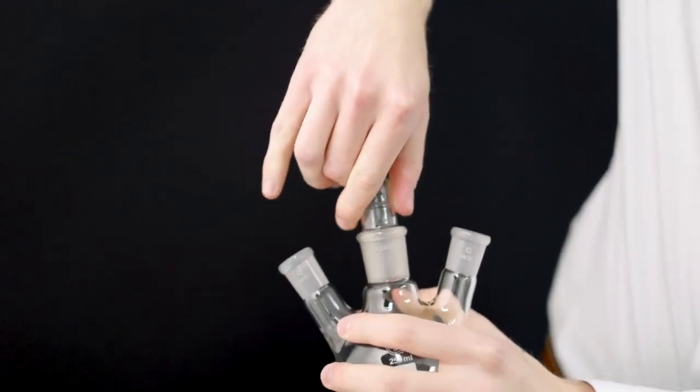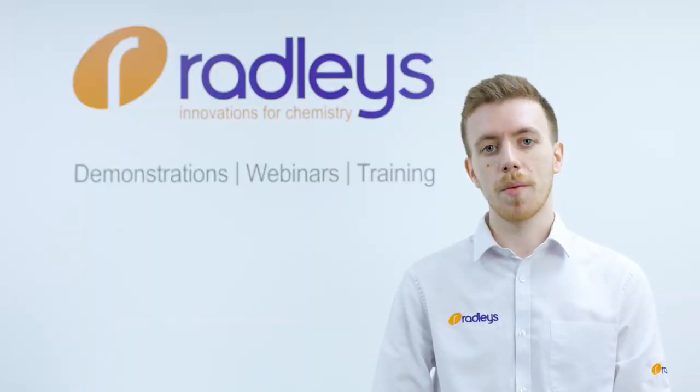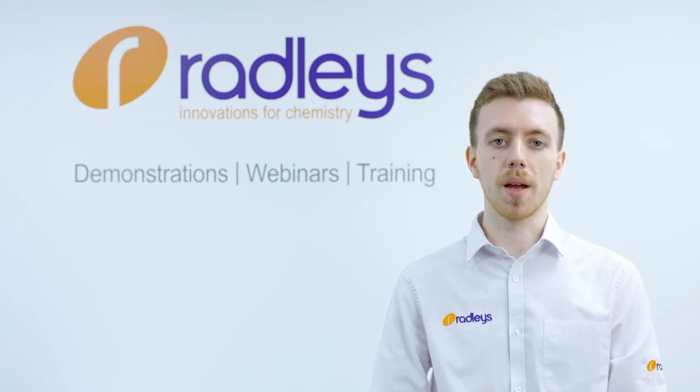A seized joint is a common problem when working with standard ground glass joints. You finish your experiment, you go to separate the cone and socket, and you find they will not come apart. Most of us have experienced this in the lab at one point or another — so how can you avoid the frustration?